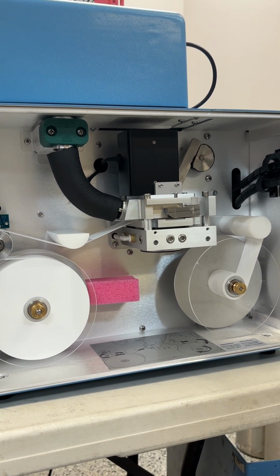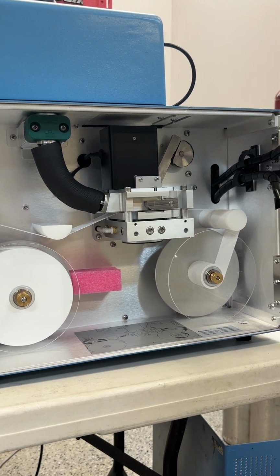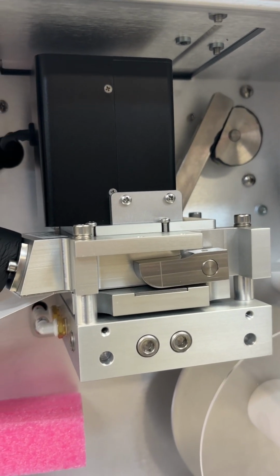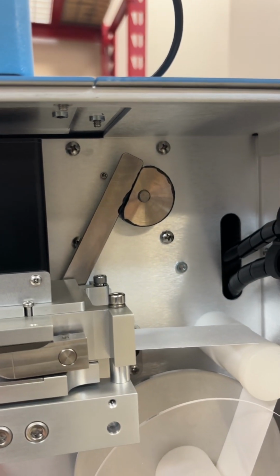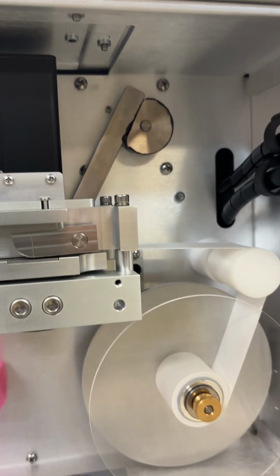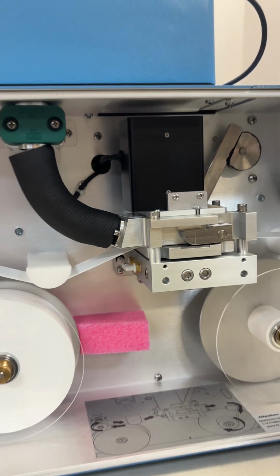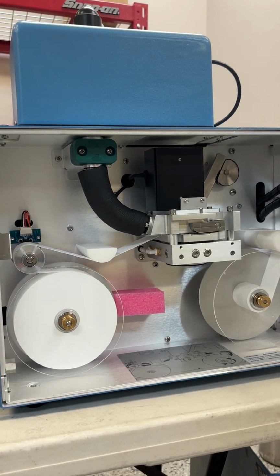So easy access from the front panel of the rack when you have this unit mounted in the shelter. And tape control, here's your mechanism where your beta detector is located. And the head assemblies, pretty much the same mechanism. It will lift the head, advance the tape. So the settings are much easier to access from the front of the unit.